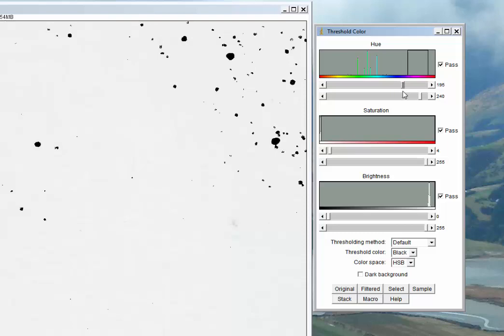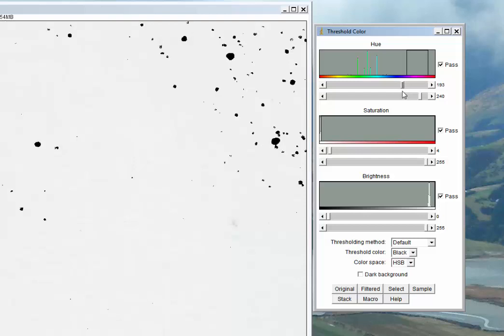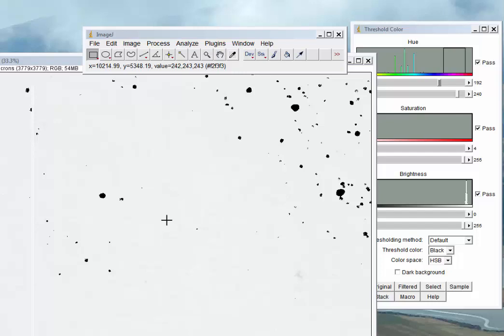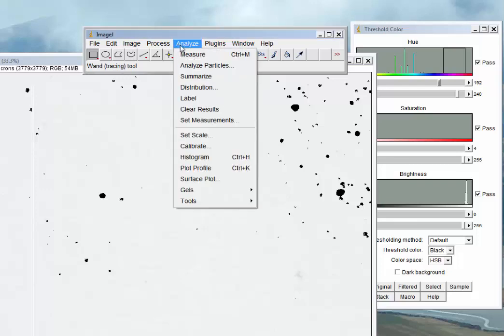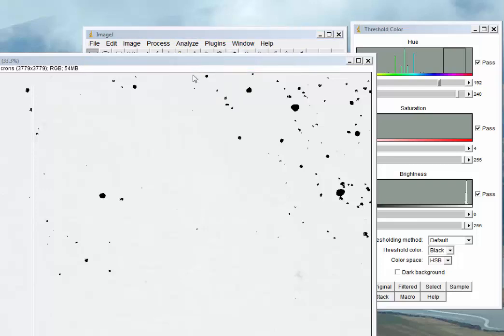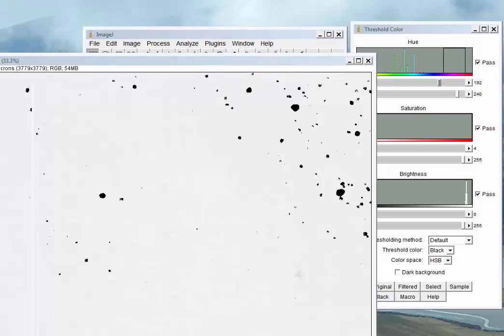I think we're probably in a decent way with regards to where we've chosen here. The next thing we can do is try and move our threshold a little bit to see if that makes any difference. Sure enough, as we go up it really does start to make a difference. Not a whole lot between 180 and 198.